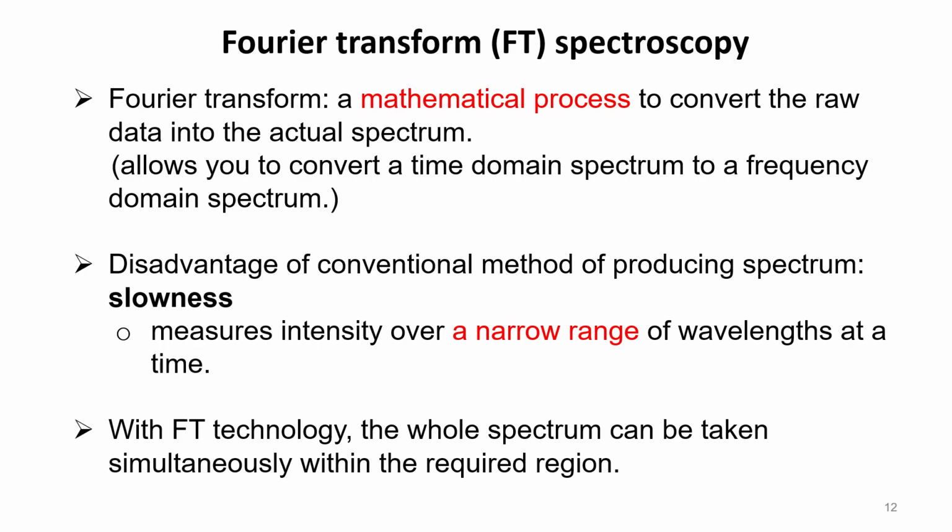As we have seen the working of the monochromator, it is an instrument that blocks all of the light except the light at a certain wavelength, which will be directed to the sample. Then the intensity of the remaining light is measured. The measured intensity directly indicates how much light is emitted or absorbed at that wavelength, where by varying the monochromator wavelength settings, the full spectrum can be measured.